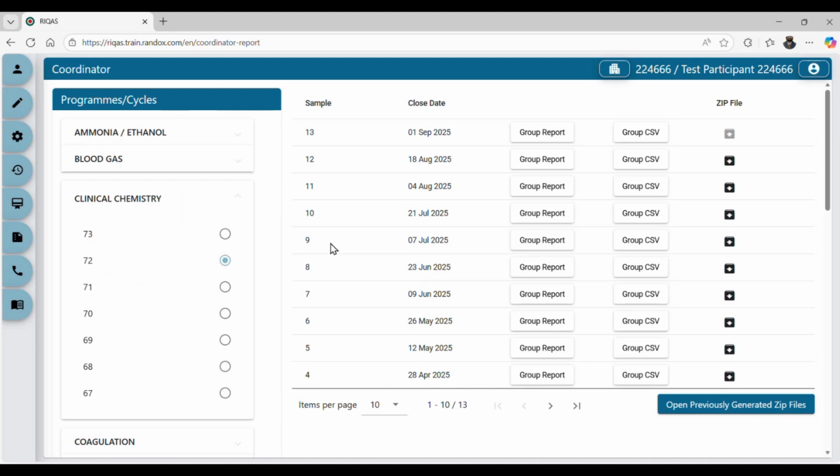All the common tests shared between all of these 5 different labs will then be displayed in a single report, therefore comparing their performances with each other, each lab's performance with the other lab, which can be very useful for lab coordinators.